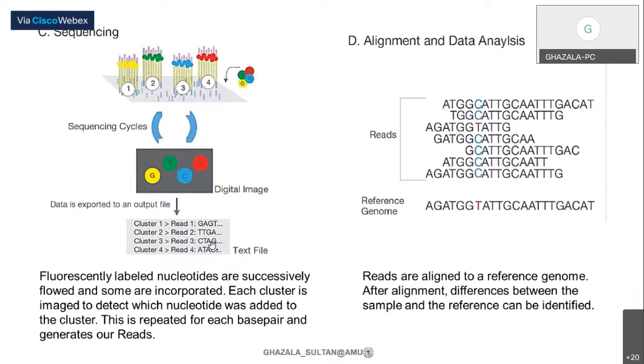Other databases are also there from where we can get the FASTQ files, but right now we just went through NCBI because of the time constraint, just to get an overview of how we can get the files from at least one database. Next, we can also have an explanatory session for these databases and explore each database as well.